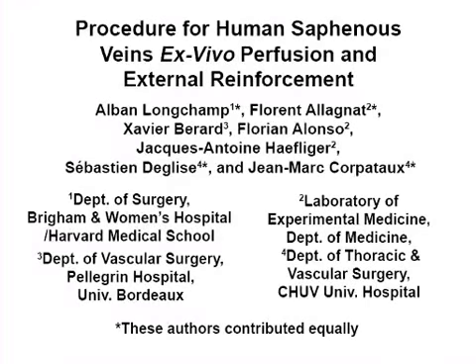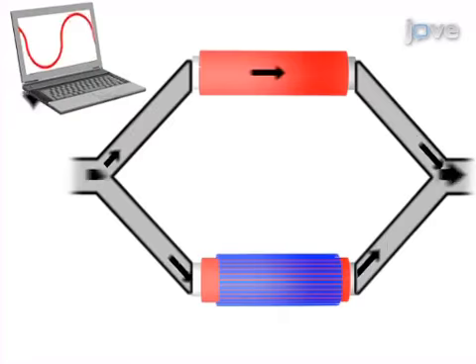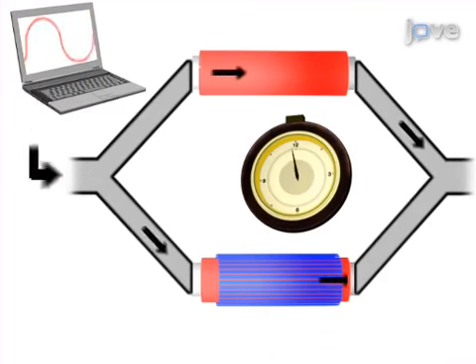The overall goal of the following experiment is to assess the influence of pressure, shear stress, and external reinforcement on human intimal hyperplasia. This is achieved by simultaneous high-pressure perfusion of two segments from the same vein, while one segment is reinforced by an external mesh.